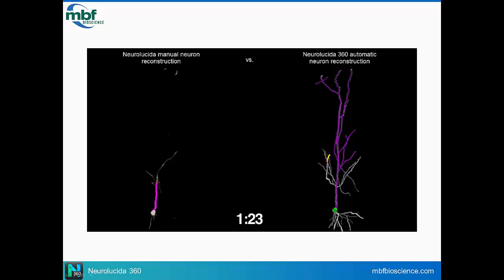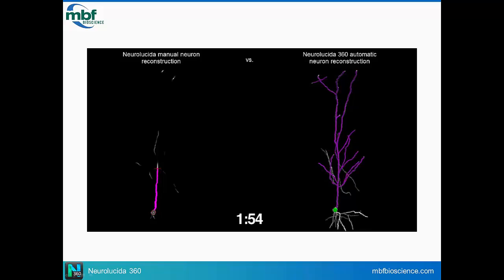The other thing that Neurolucida has going for it, similar to the other programs, is that there's a long lifetime of development invested into it, and so you have 25 years of analyses, like I talked about for Neurolucida Explorer, that run the gamut from everything from Sholl analysis to convex hull to individual spine density questions to classification to fractal analysis.